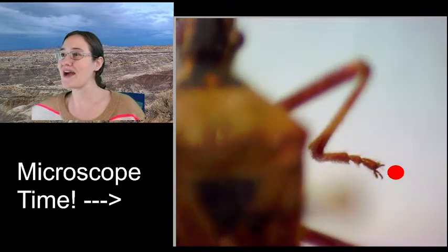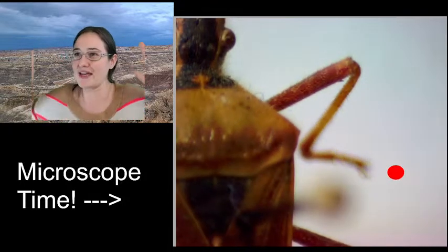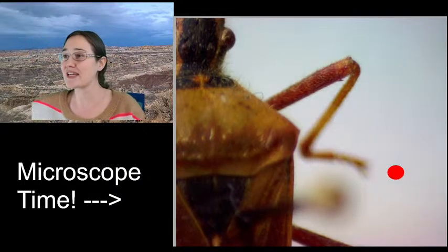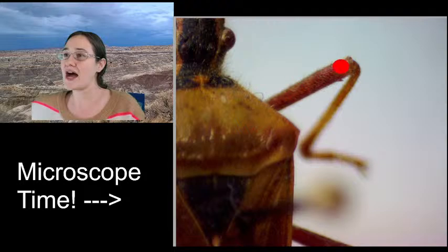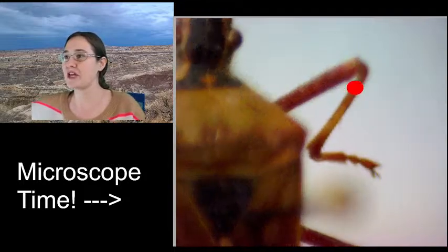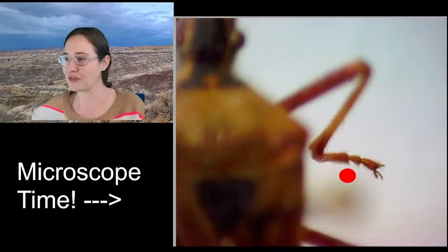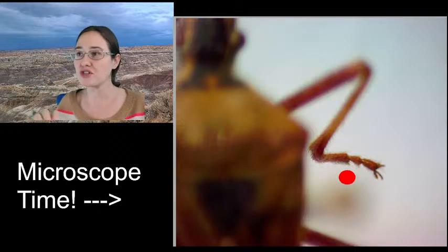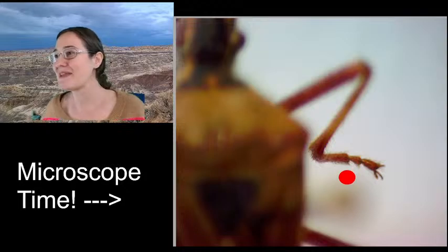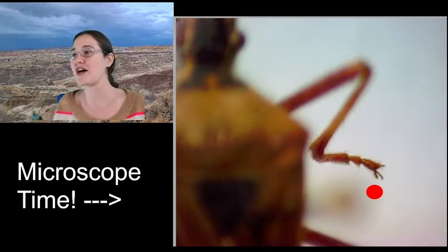All right, so we are checking out these legs. Keep in mind, he's in this position where he's walking, so I'm not going to be able to get his entire leg in focus at the same time. Right up here, this is our femur. And then if we zoom a little bit, this is going to be our tibia. And then we have 1, 2, 3 individual tarsal segments. Those tarsal segments are like little toesies, right? And then at the very end of the tarsal segments, we've got tarsal claws, which are these two little guys right here.